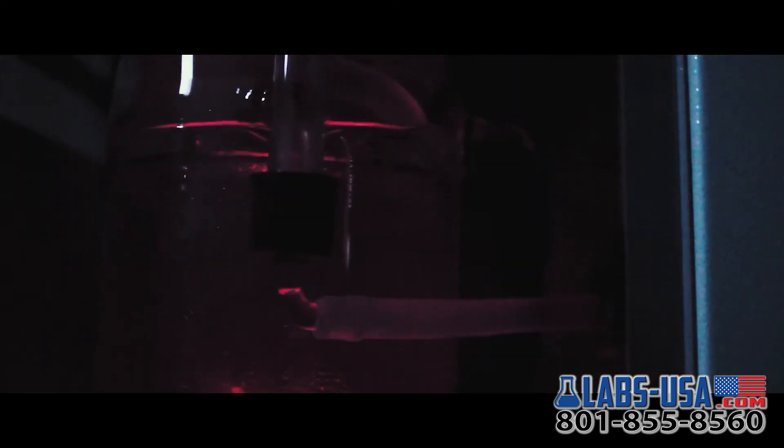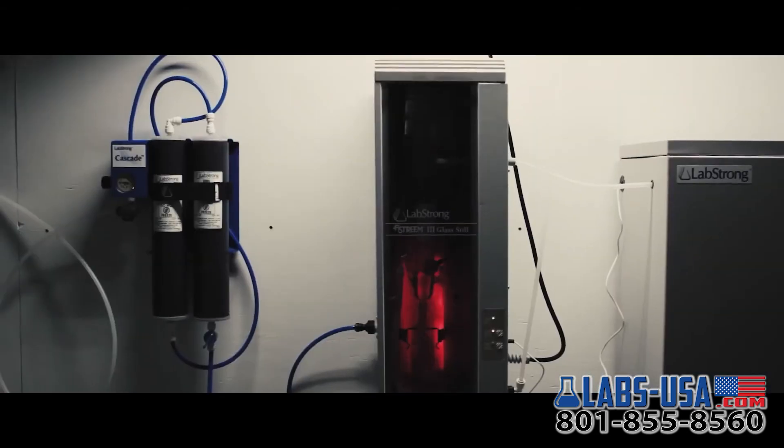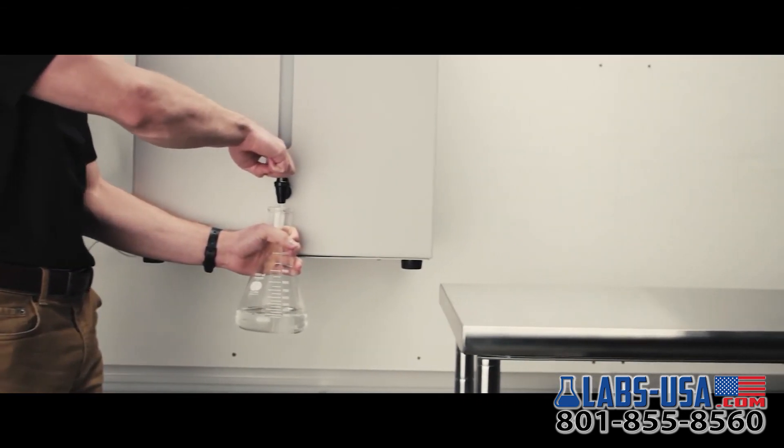Our boilers are 97% efficient heating phase change. Since distillation requires two phase changes, there are two unique barriers for all impurities. That is why distillation is still an exceptional, reliable, and consistent producer of pure water.